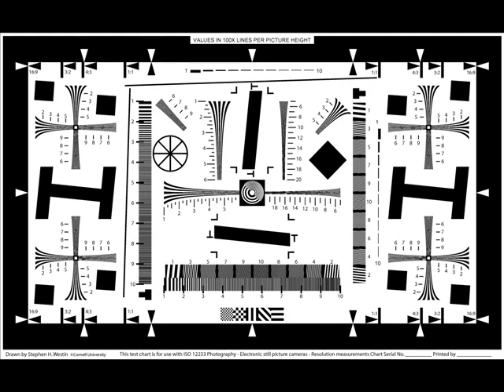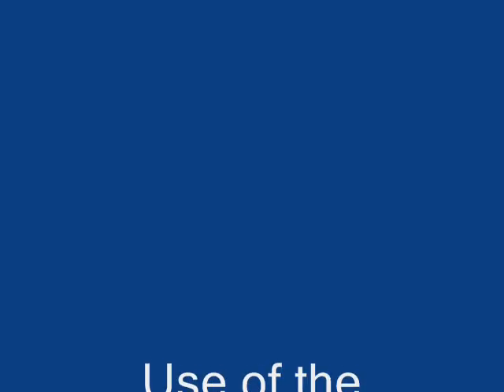Now the resolution of this compound light microscope is 0.2 microns, also called 0.2 micrometers, meaning that two objects can be 0.2 microns away when viewing them under the microscope and you can still see them as separate and distinct. For example, two cells.